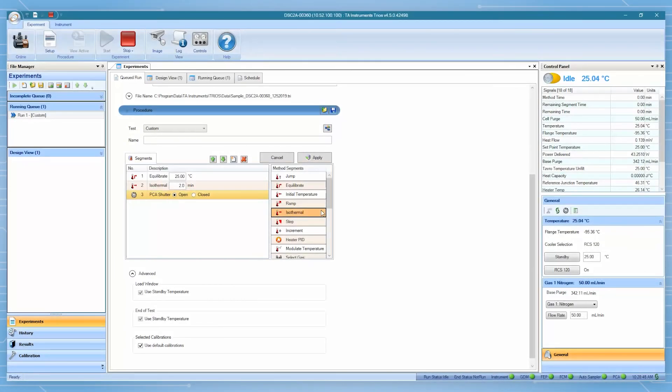Shutter open. Keep isothermal for desired exposure time. And then close the shutter.